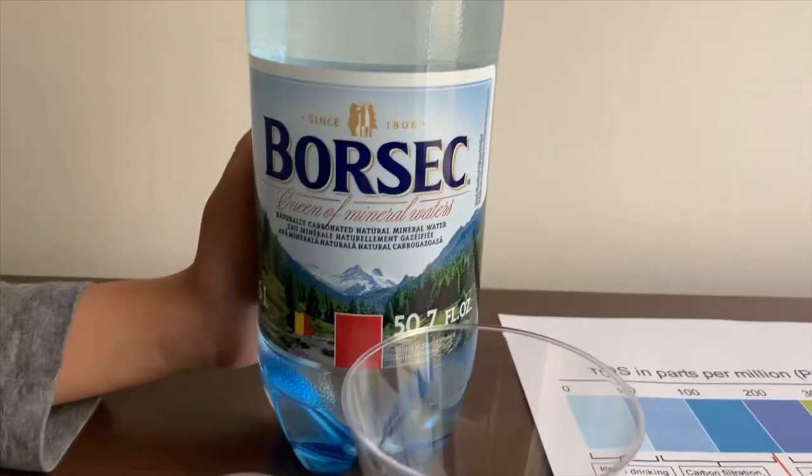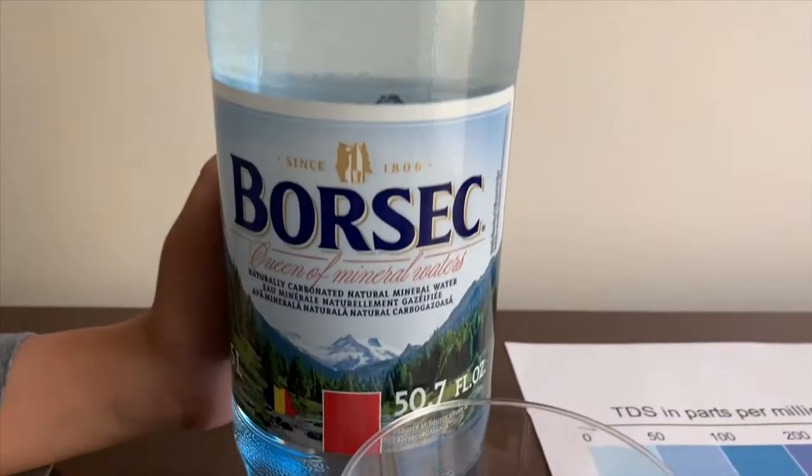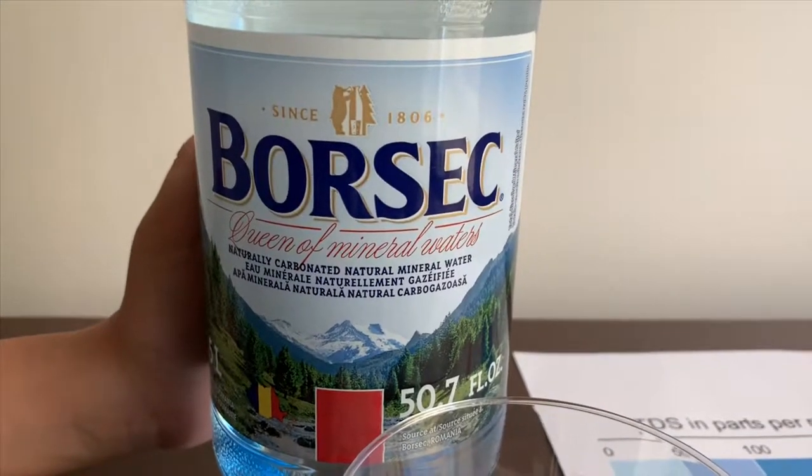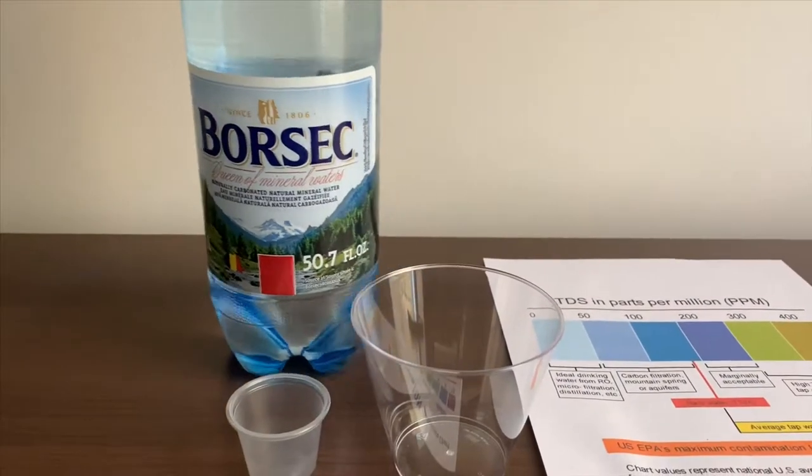This is Borsec natural carbonated mineral water. It costs $1.49 and it's sourced from Borsec, Romania. Let's test the pH and TDS levels.